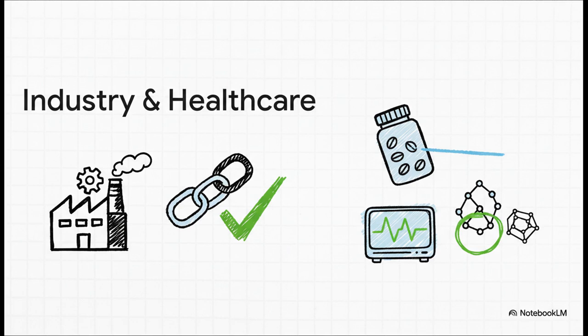It's pretty amazing. And in industry and healthcare, the impact is massive. These tools are used for quality control, making sure the plastics in our phones and cars are made right. They're developing ways to spot fake medicine without even opening the box. And in hospitals, they can even be used to monitor the gases a patient is breathing in real time during surgery, which is absolutely critical for safety.